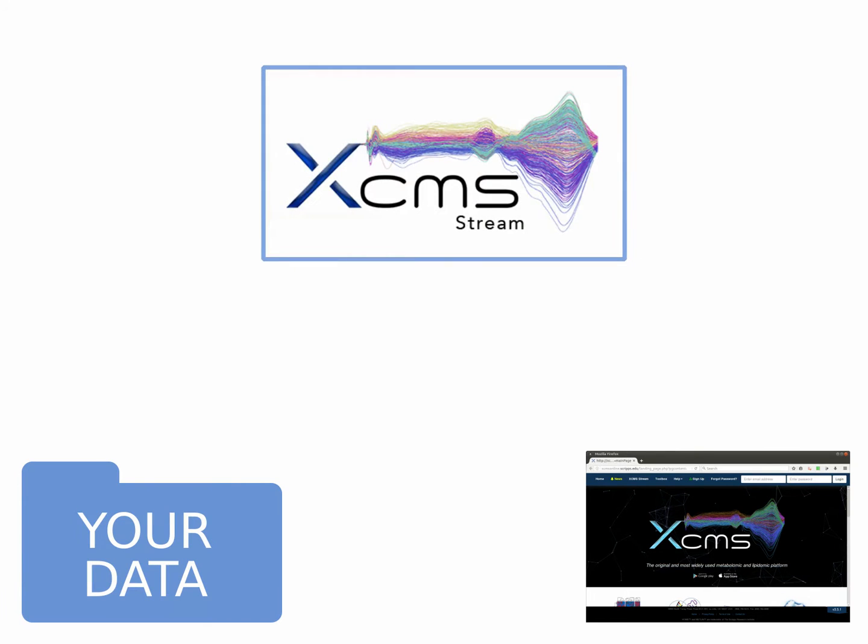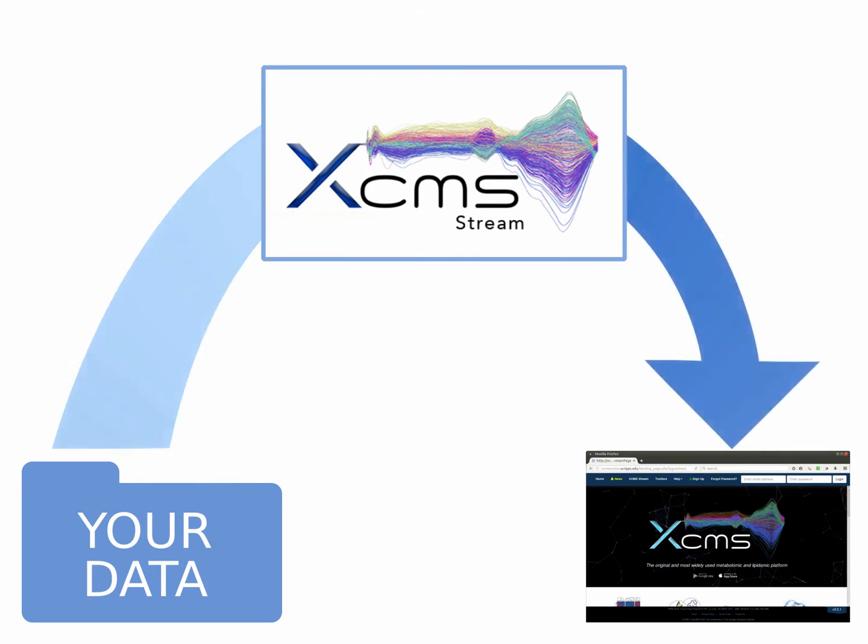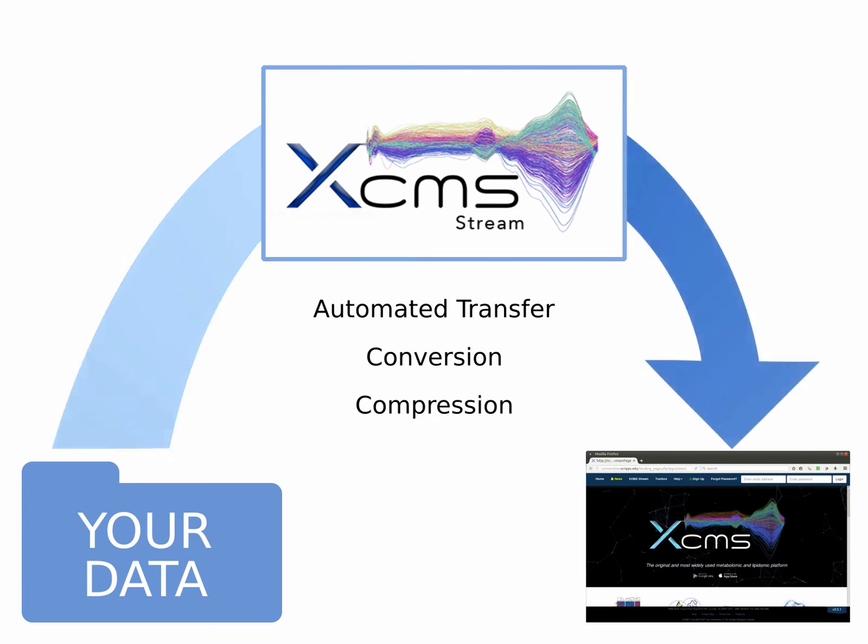This new tool is called XCMS Stream and is freely available to all XCMS Online users. We use both cloud and streaming technology, which allows us to automate data transfer, conversion, compression and job submission.